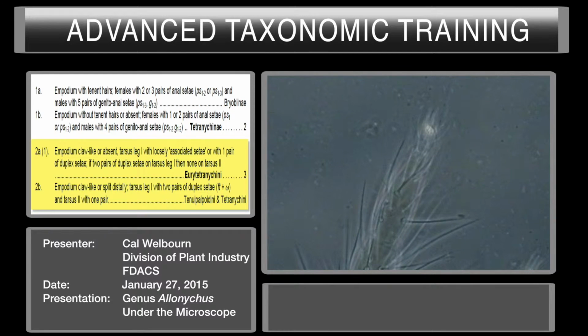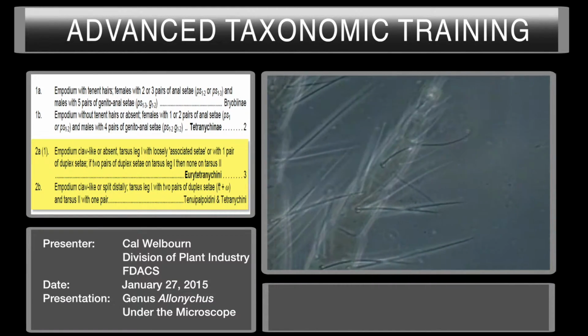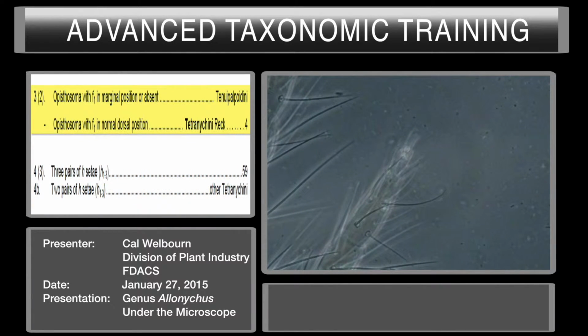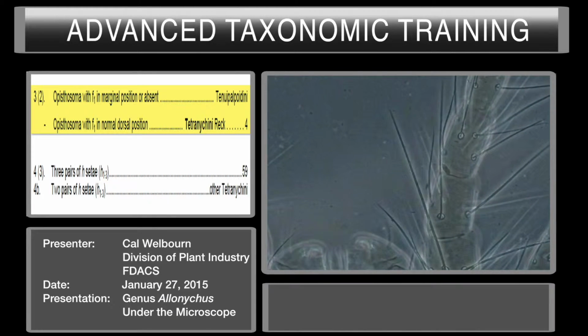Now we should look at tarsus leg 2. See how many duplex setae are there. And there's one right there. Remember, the duplex setae are made up of a solenidion and a small adjacent seta. The setal bases actually touch. Okay, so we're moving on to couplet 3. We're looking at the f setae. See where they are.